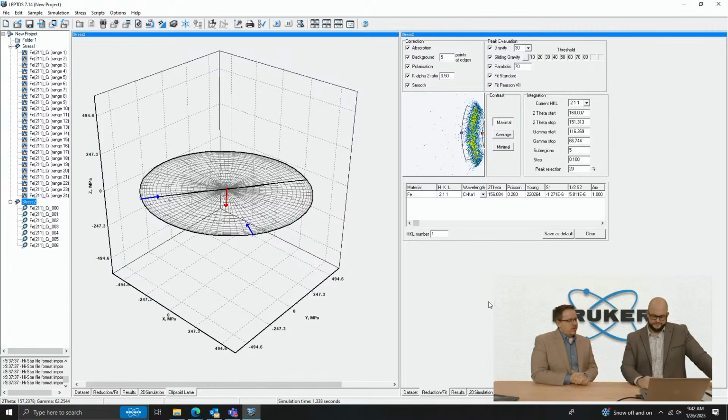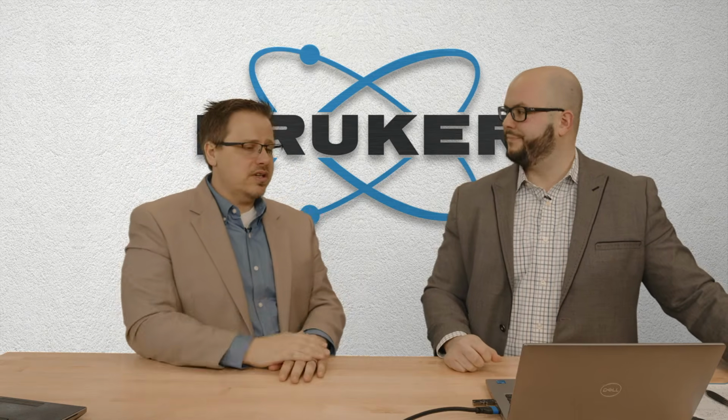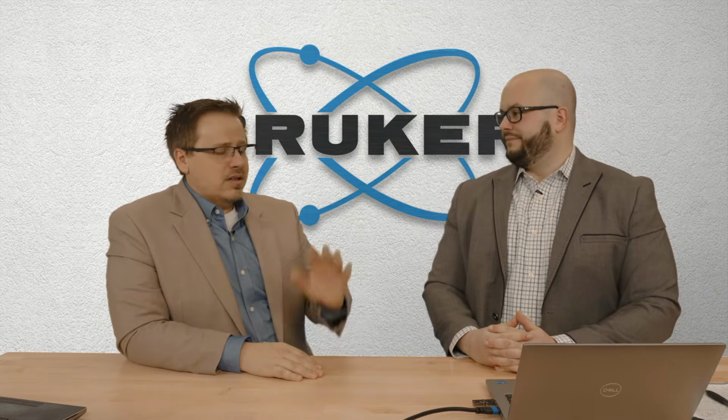So that is now stress. Now there are other things that we could do here. It's called the multi-HKL method. That's where you can actually just do a normal theta 2 theta scan. It uses the fact that the diffraction vector changes an angle. It uses multiple HKLs. That's useful for GID stress, things like that. That's all built in here.